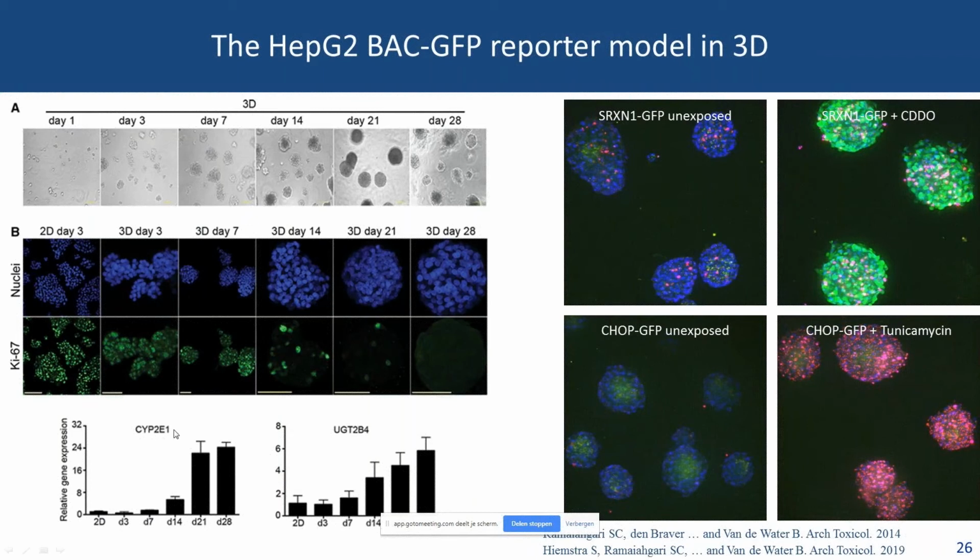And by the way, these P450 enzymes are really important in hepatocytes, because hepatocytes normally convert drugs and detoxify drugs. But sometimes we also see that for some compounds, the parent compound is not toxic, but the metabolite is toxic. So if you miss the enzyme that's converting the parent compound into a toxic metabolite, you might have a false negative. So therefore, this CYP expression is quite important.